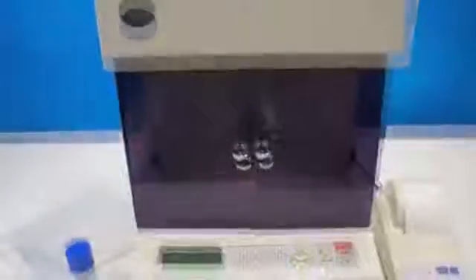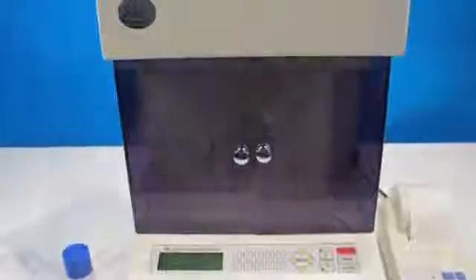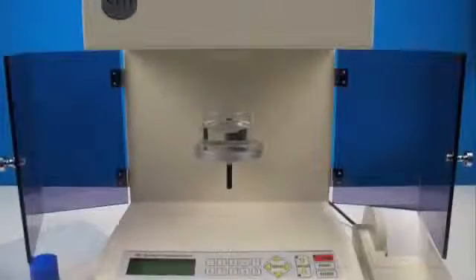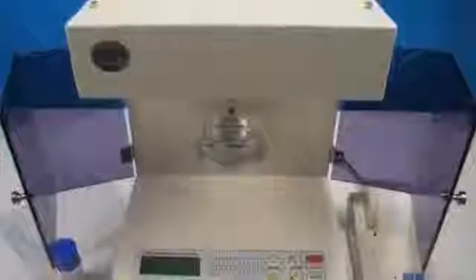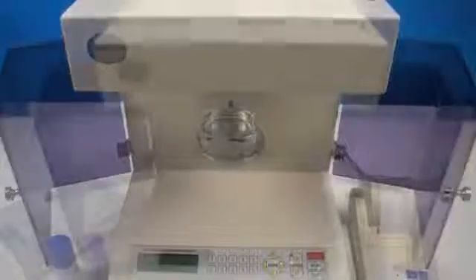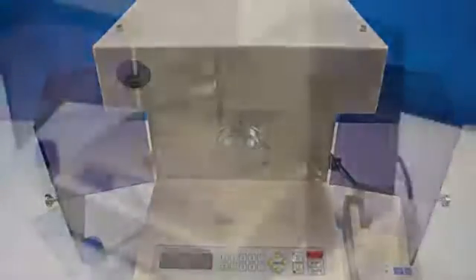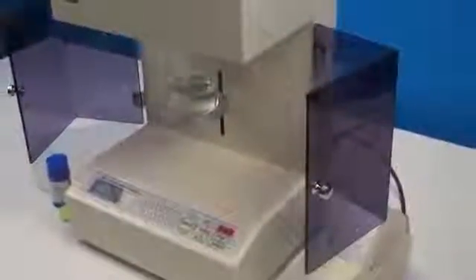The DST-60 Automatic Surface Tension Analyzer offers operators ease of use and the ability to take repeated and accurate measurements with the press of a button. The DST-60 is an automatic digital tensiometer capable of measuring surface tension between liquid and air and interfacial surface tension between two liquids. The DST-60 can employ either the Denoy ring or Wilhelmi plate method.